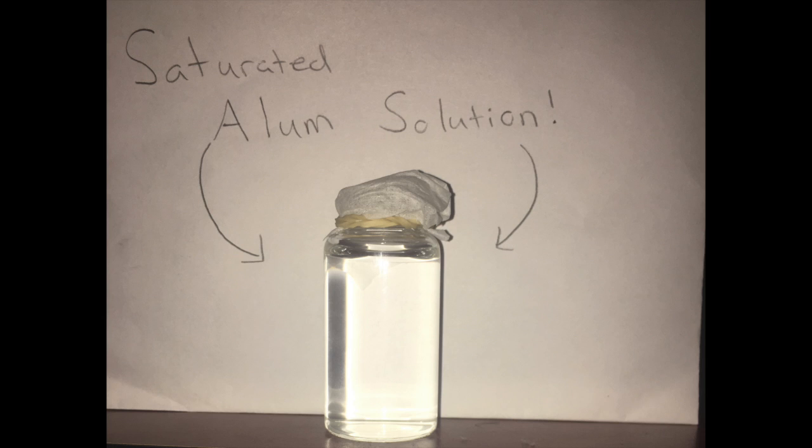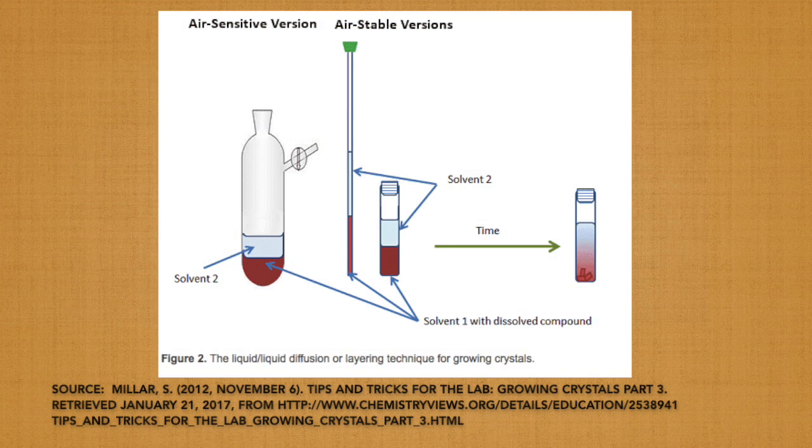Perhaps more time is still necessary for the water to evaporate. I will continue to keep an eye on the solution for the days to come. In this experiment, we used a slow cooling technique and are now using a slow evaporation technique to form crystals. However, a liquid-liquid or liquid layering technique could also be used to form different types of crystals.